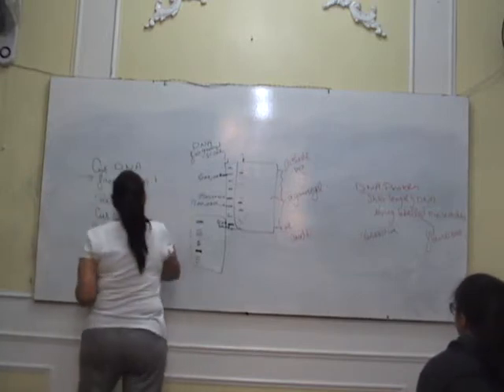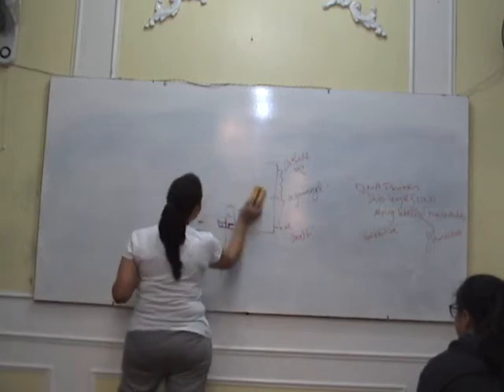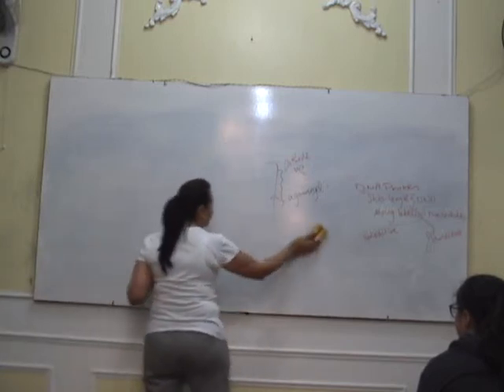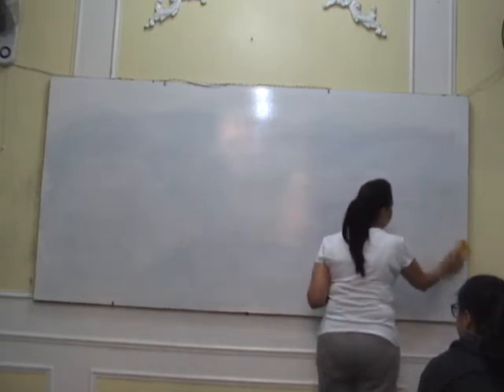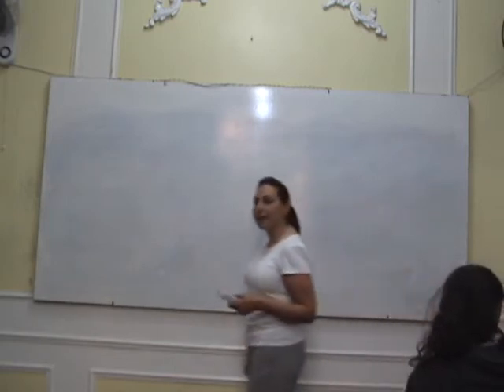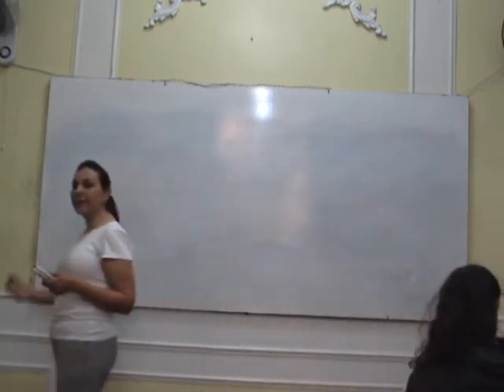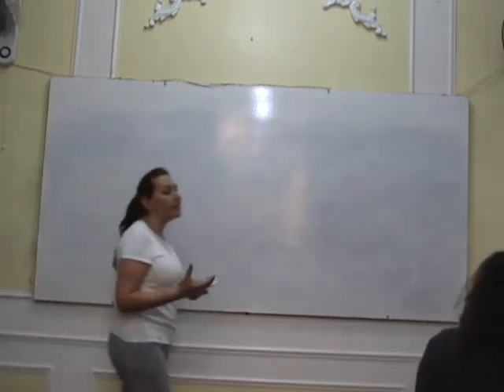Okay. Can I use gel electrophoresis to separate proteins of different alleles of the same gene? You know that different alleles are going to make different proteins because they have different base sequences, giving different amino acid sequences. And again, proteins have charges.